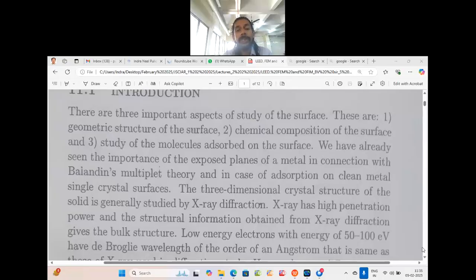Among various spectroscopic techniques, there is no substitute to XPS to characterize the surface of solid materials, to know the chemical composition of the surfaces, the elemental composition, and the valency. What is valency again? Valency is the combining capacity of elements, in what oxidation state a particular element is there, per se vanadium, per se lanthanum.